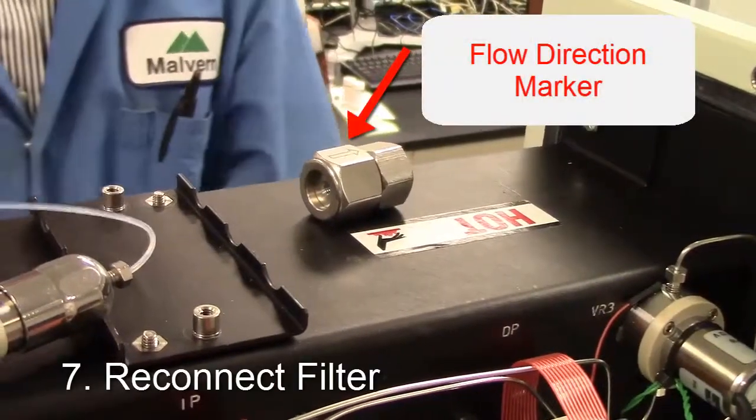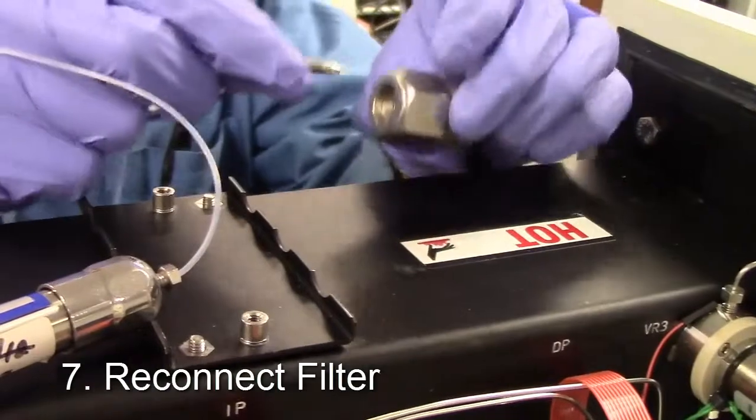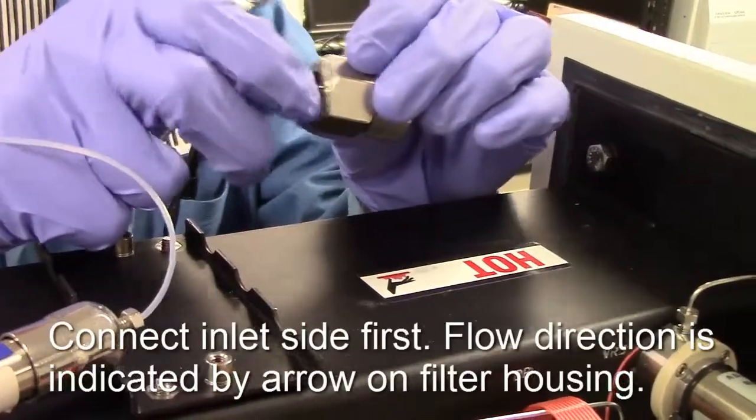Step 7. Reconnect the filter. Using the flow direction marker, connect the inlet line to the filter.